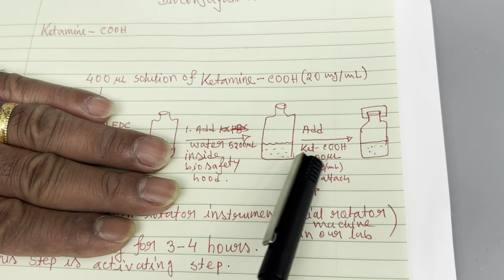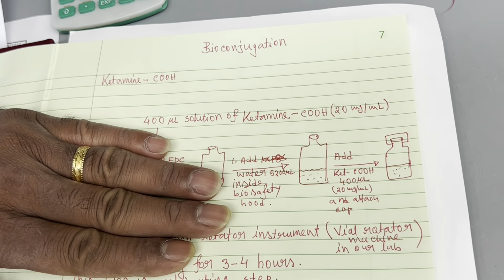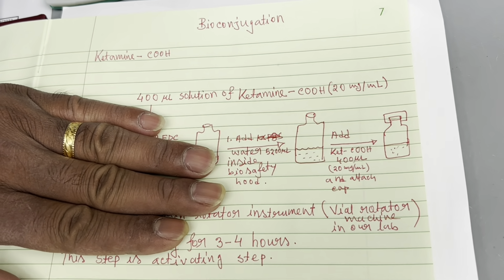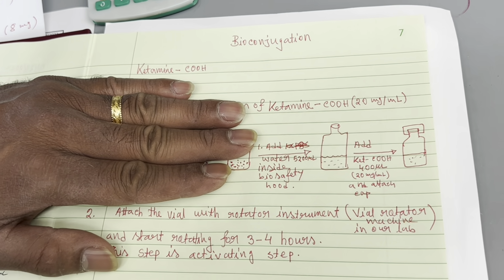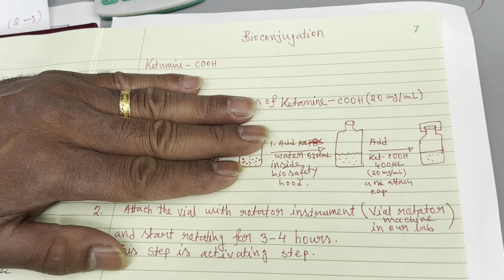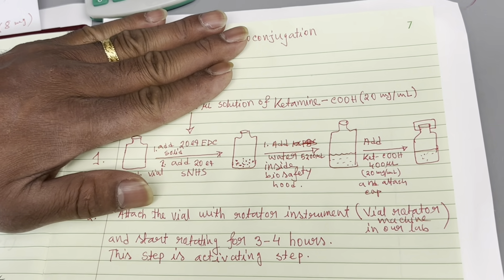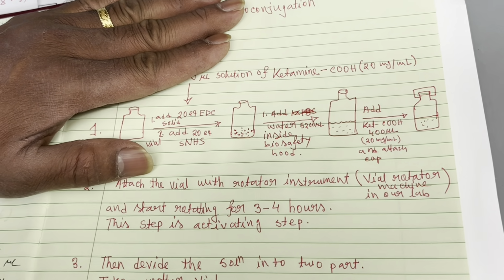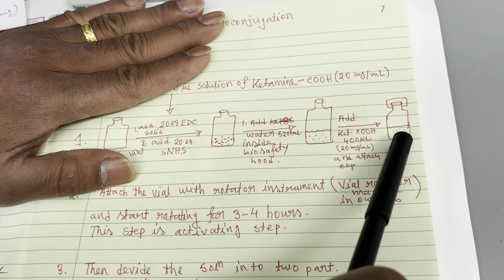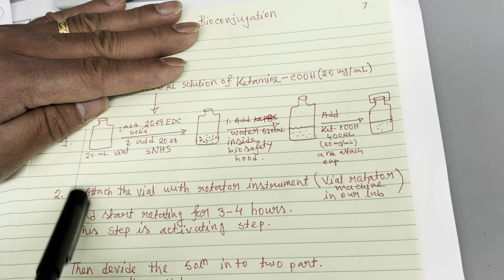Once it is added, then start rotation with the rotator. We'll show how to do that. That will take a certain time for the activation of the N-hydroxysulfosuccinimide.